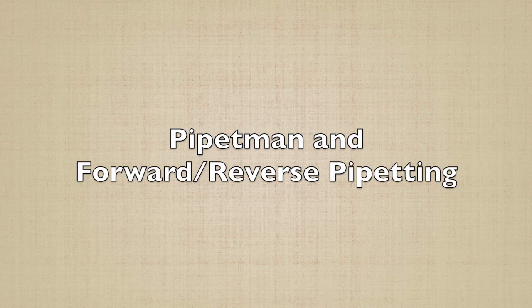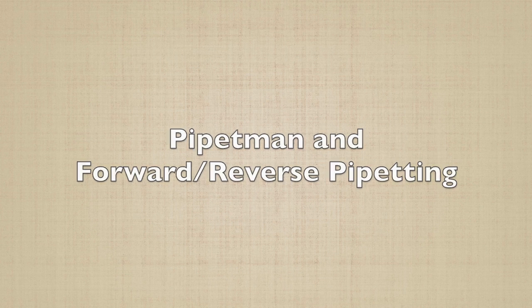In this video we will introduce you to pipetment pipettes and how to perform forward and reverse pipetting using these pipettes.